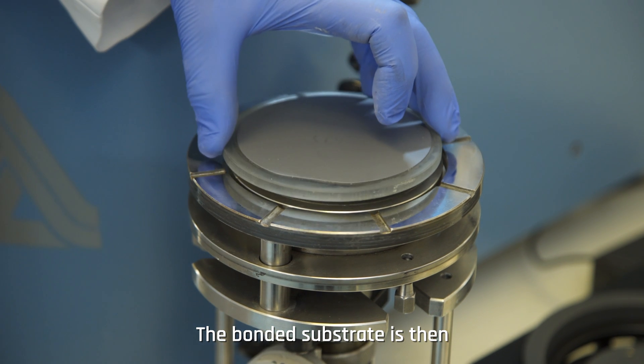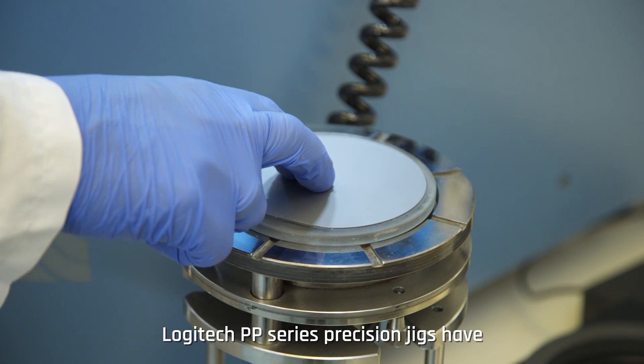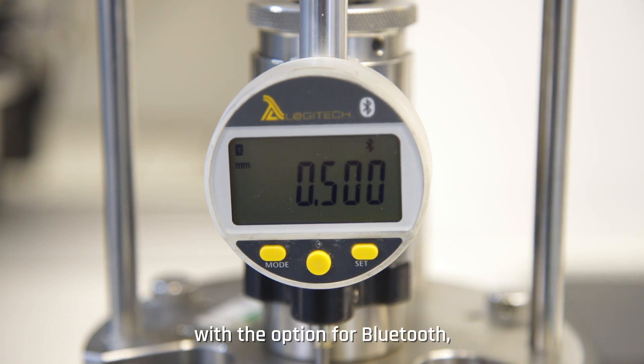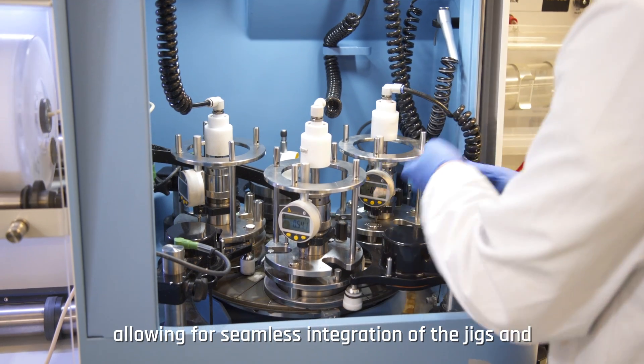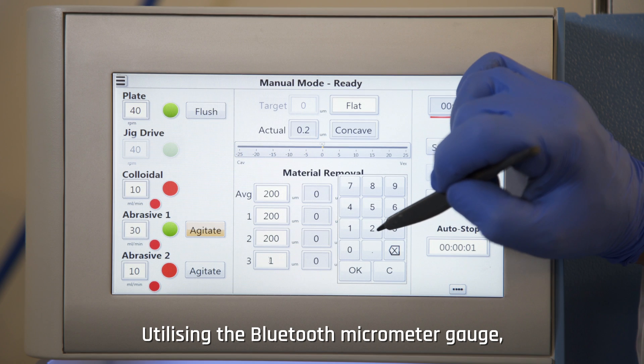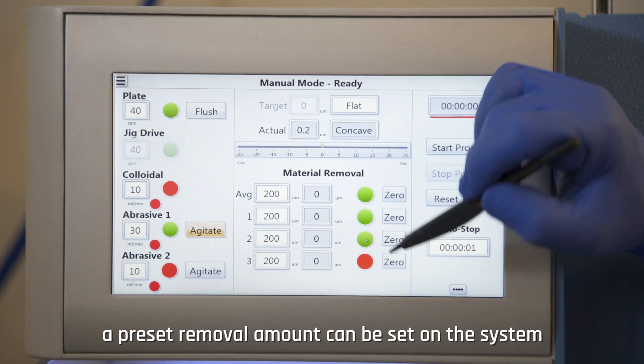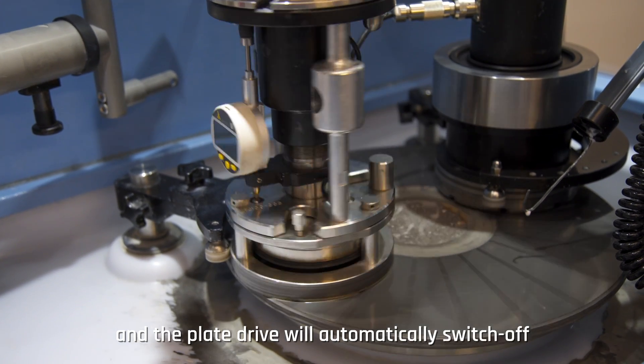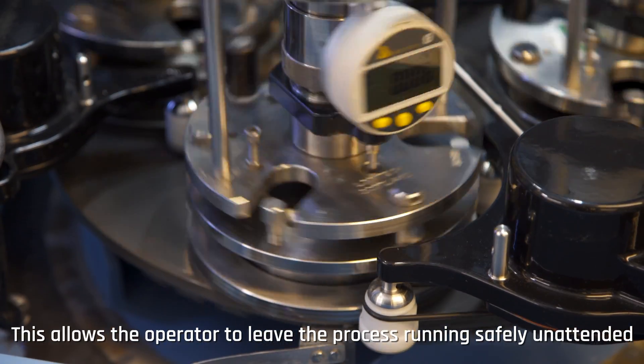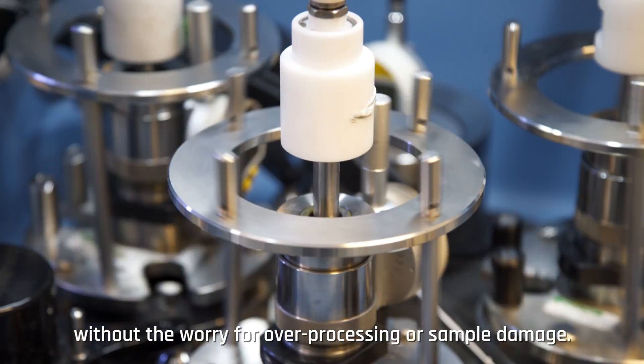The bonded substrate is then mounted onto a Logitech precision jig for processing. Logitech PP series precision jigs have easy to read digital dial gauges with the option for Bluetooth, allowing for seamless integration of the jigs and our range of precision lapping and polishing systems. Utilizing the Bluetooth micrometer gauge, a preset removal amount can be set in the system and the plate drive will automatically switch off when the target amount has been achieved. This allows the operator to leave the process running safely unattended without the worry of over processing or sample damage.